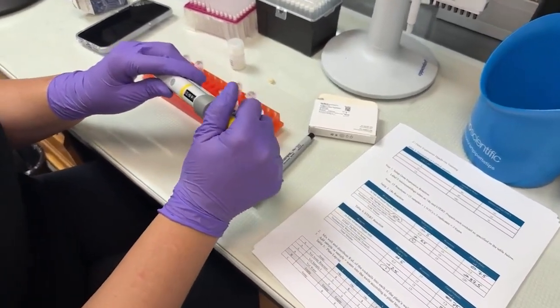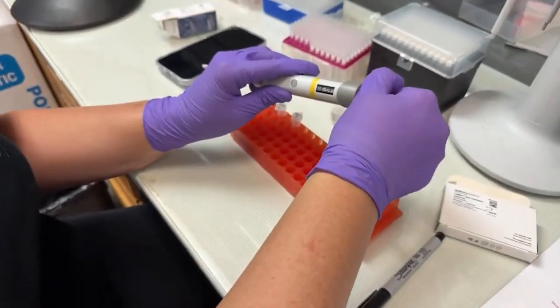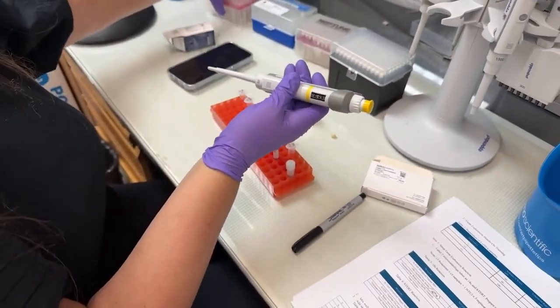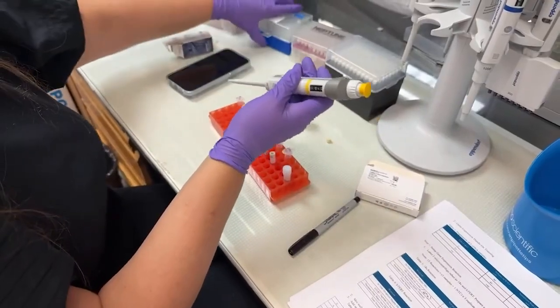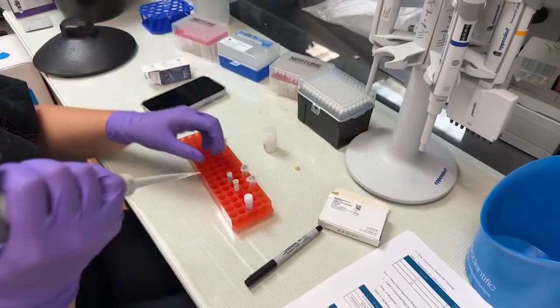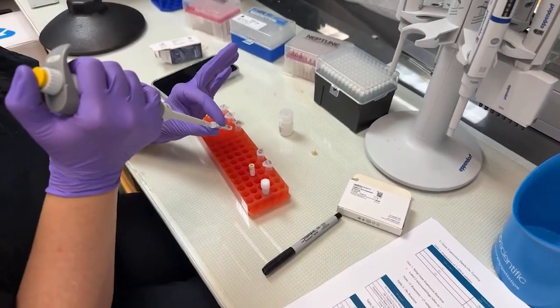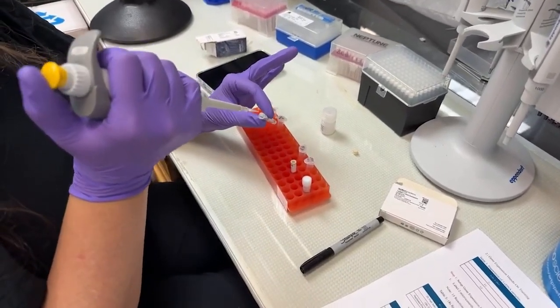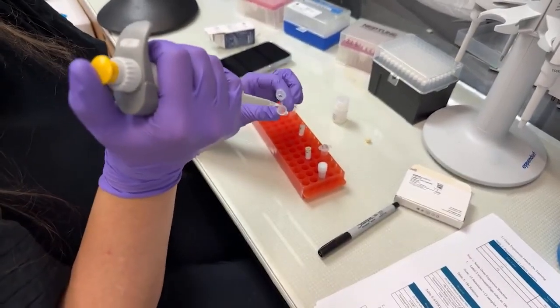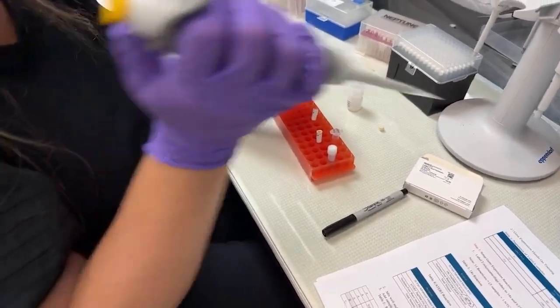So now I need the 10 microliter pipette that I'm going to dial up for 7.5 microliters. I have to use the tips that are designed for this pipette. I believe are these. Similar process: push the plunger down, put the tip in, pick up the solution, pull the tip out. Now go to its landing location, open up the tube, dispense the material, push the plunger, and we're done.